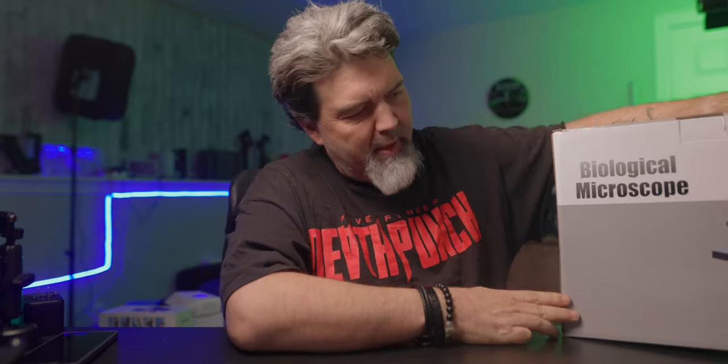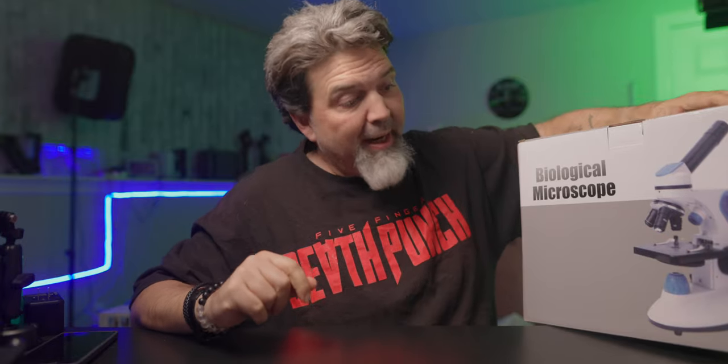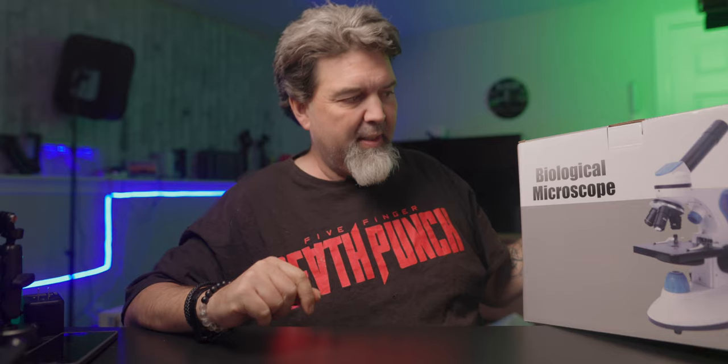You know, sometimes you get something that you're like, that may be kind of fun, bring you back to the old-school days. Today we got this. I don't know if there's anything extra cool about it, like can I hook my phone into it? I don't really know. I will leave some information down below once I stumble on it, but I thought for today this would be kind of cool to take out and just try it out and see.